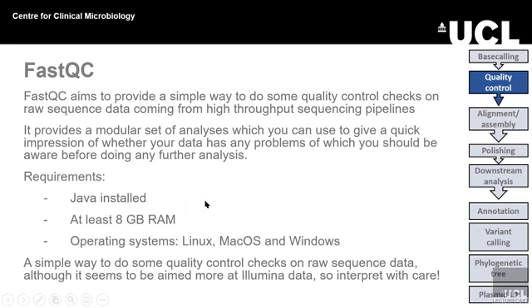So the requirements: you need to have Java installed. You need to have at least 8 gigs of RAM, which is most normal laptops. And you can use this using Linux, Mac, or Windows.